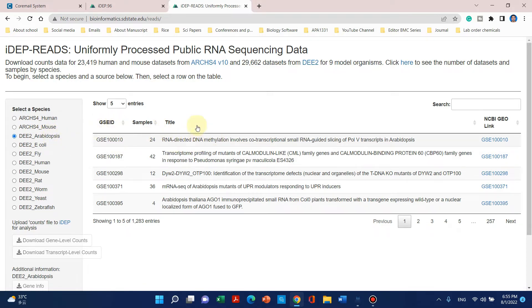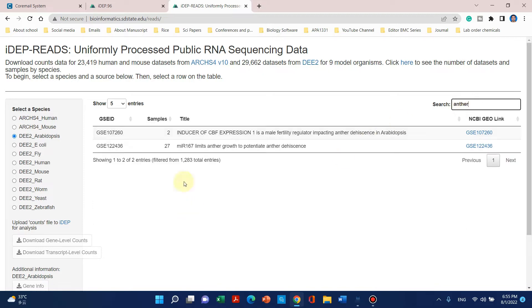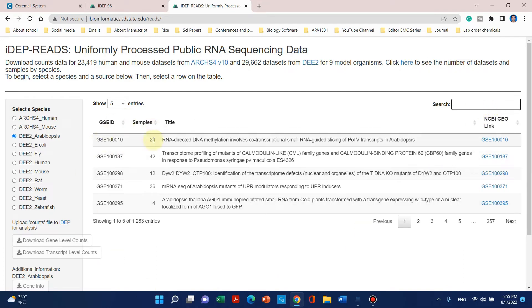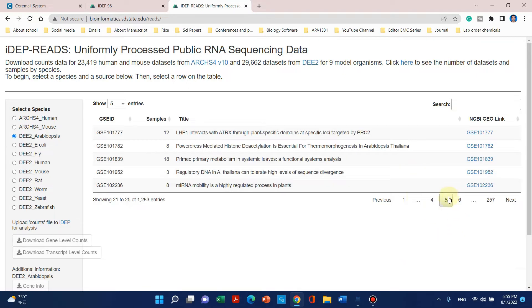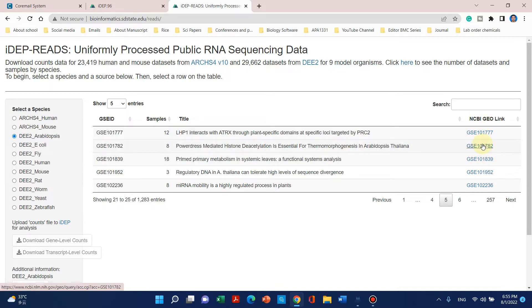Now we can see the list of IDs which contain the RNA sequences for Arabidopsis. You can also search your keywords — for example, I can type 'anther' to filter results. It is up to us which trait we want to analyze. Let's go to a random page — let's say page number five — and we can see a study: 'POWERDRESS-mediated histone deacetylation is essential for thermomorphogenesis in Arabidopsis thaliana.'